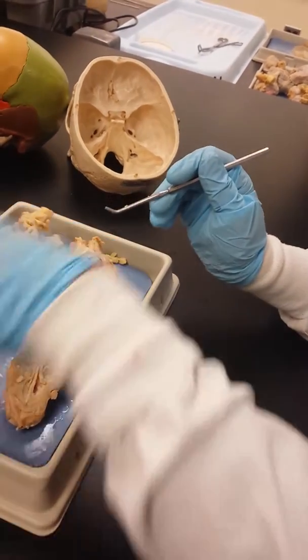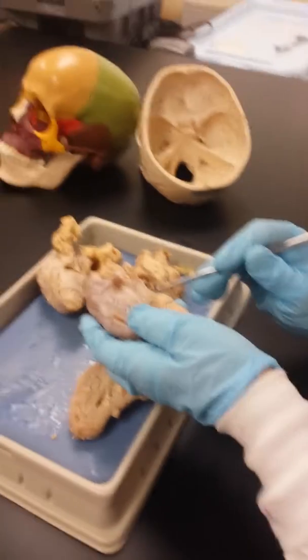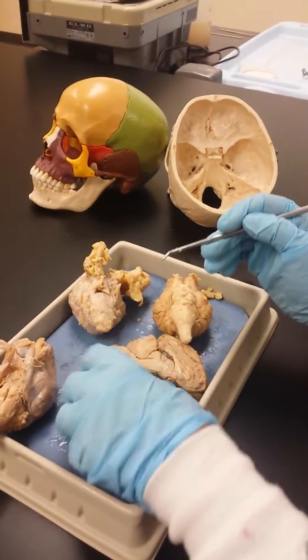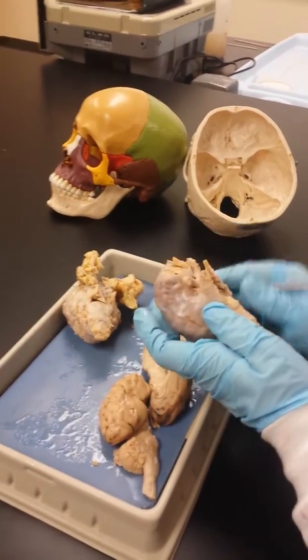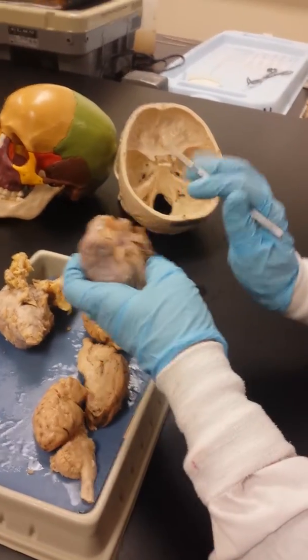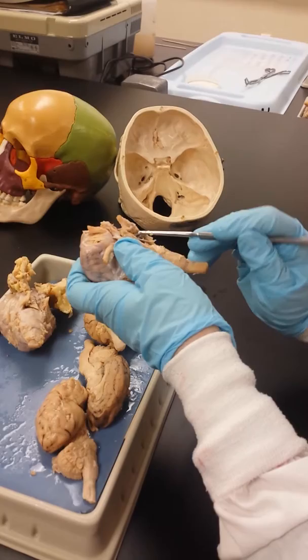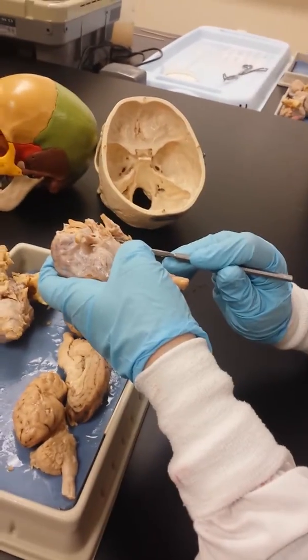We'd have to take that out of there, so that would be a good one right there. How would I tag that? Carefully is right. So that's one of the problems that make the brain hard. It'd be easy for me to tag this one, right? Because they can't miss it. It'd be easy for me to tag this or to tag that or to tag any of these. But to get into there, I'd probably have to lift it up like I did the phrenic nerve and then tag it like that.